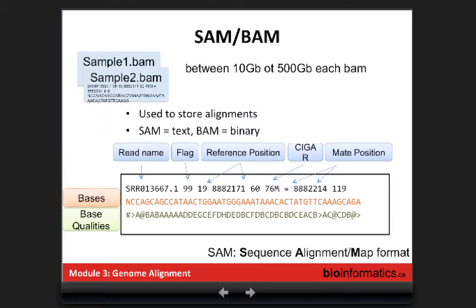the mapping. So if your mapping quality is bad, if you are not a primary alignment, all these kinds of features that you can use to describe your alignment, to give some kind of parameter of your alignment. Then you have your reference position, so the chromosome and the position. You have the quality score of your alignment, a Phred score as we saw, for the best quality. So it's a probability, minus 10 log of the probability that your read is not mapped correctly.